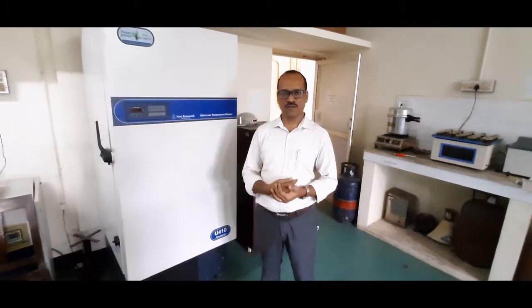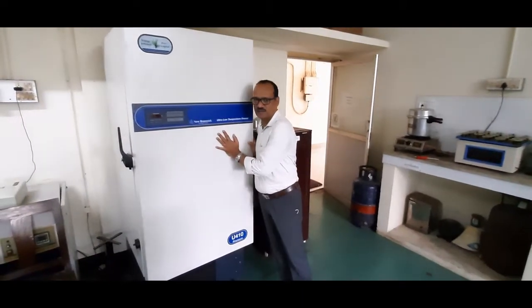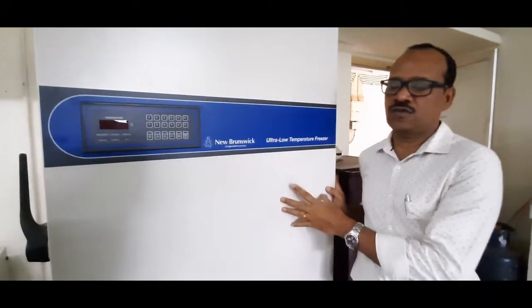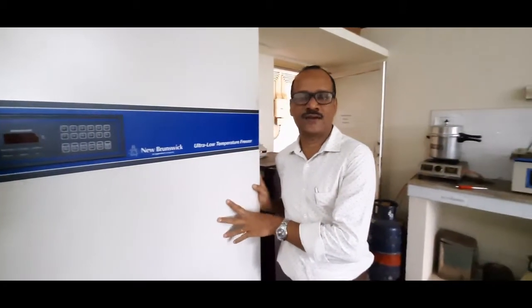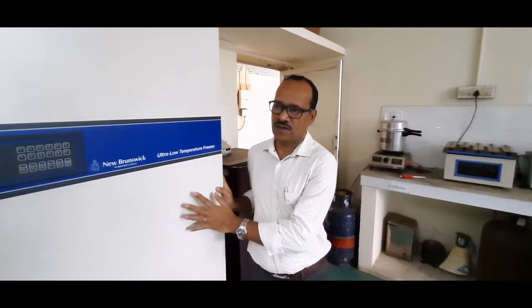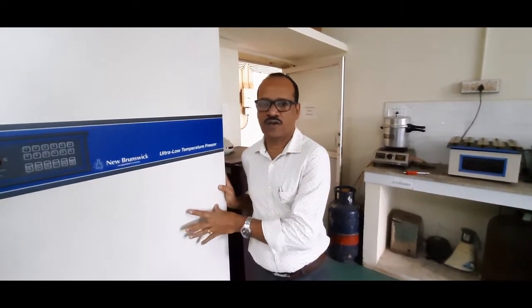In the lab we have different levels of storage. For short-term storage we can use 4°C or below that, and for long-term storage we need a freezer like this — this is a minus 80°C freezer, where you can store samples for years. Nucleic acids, when exposed to the environment, degrade. So it is necessary to store samples in minus 80°C freezers so that we can store them for a longer time.